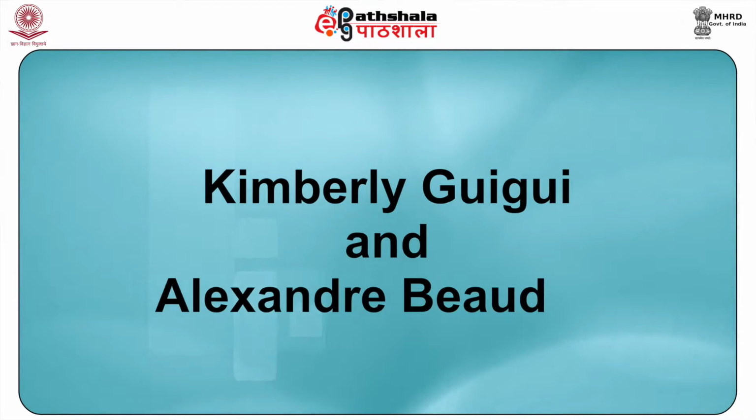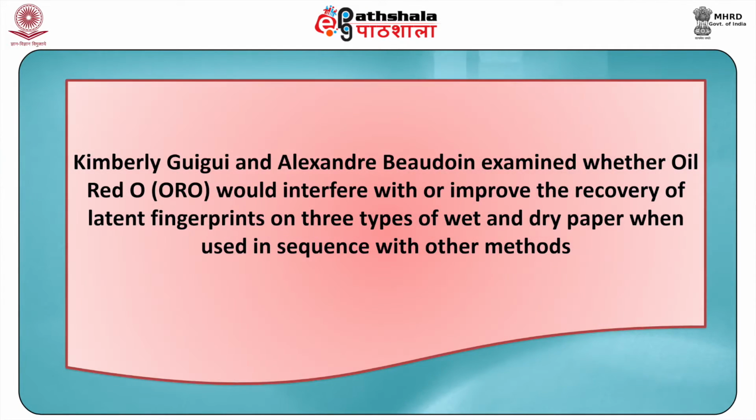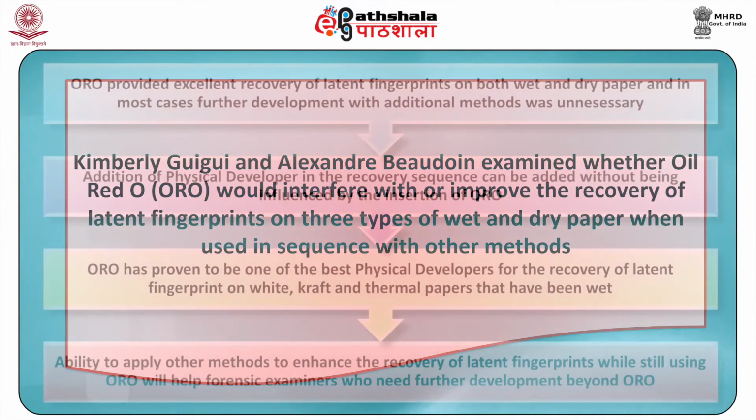Now, let us see a study by Kimberly and Alexander. Kimberly and Alexander examined whether oil red O would interfere with or improve the recovery of latent fingerprints on three types of wet and dry paper when used in sequence with other methods.